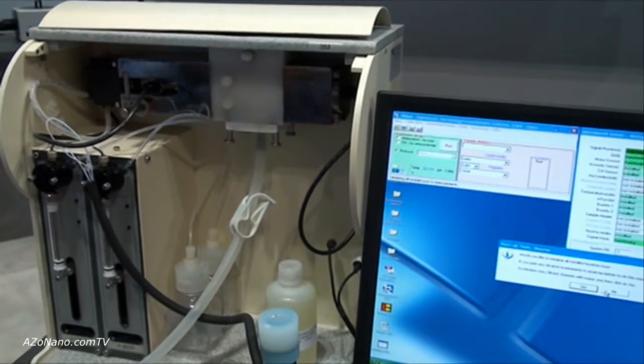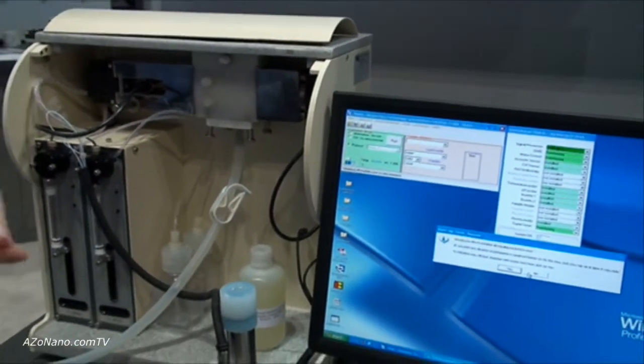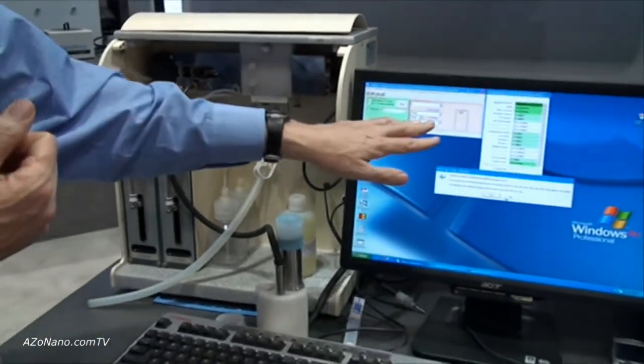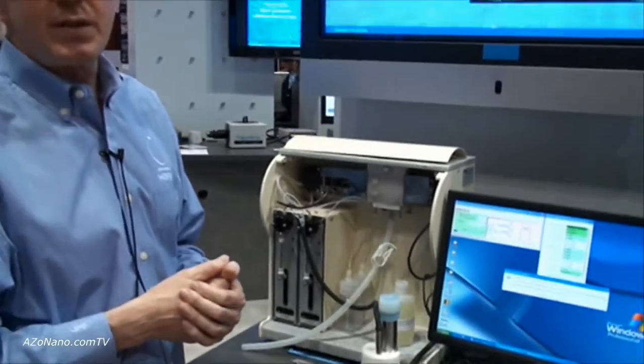The only thing we need to know here is what's the density of the material. We also need to know what's the volume concentration. We input that information into the system. It goes out and performs the measurement and we will develop the particle size distribution of the concentrated sample without any dilution.